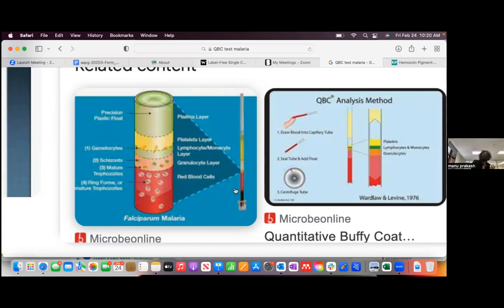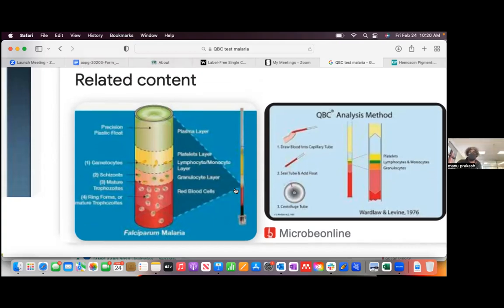And once you've done the density separation, between this layer, this is called a buffy coat, you can think about platelets being much lighter. RBCs have the highest amount of hemoglobin in them, so they're the heaviest. Granulocytes and lymphocytes, these would be your white blood cells. All types of cells will start reorganizing, and they do a really clever trick. Actually, maybe if you want to now see this layer, traditionally, if I was to do it in a single capillary, the first thing that you always see is blood and you will see plasma.